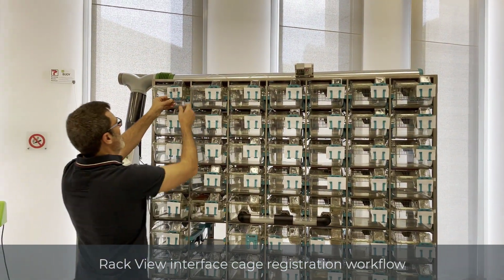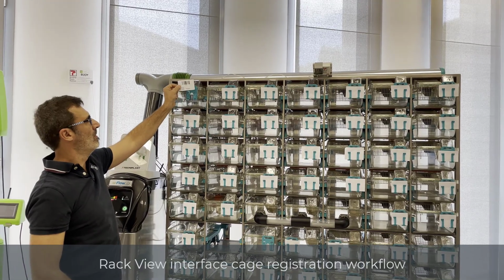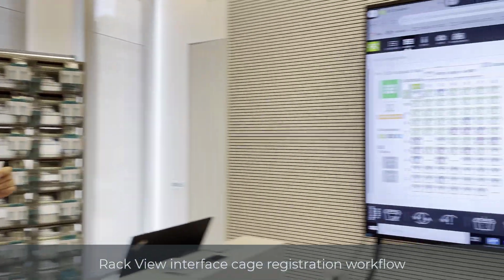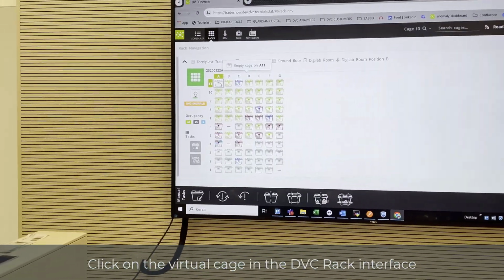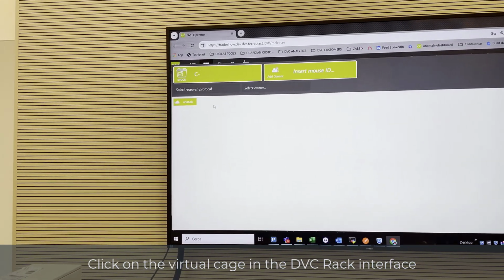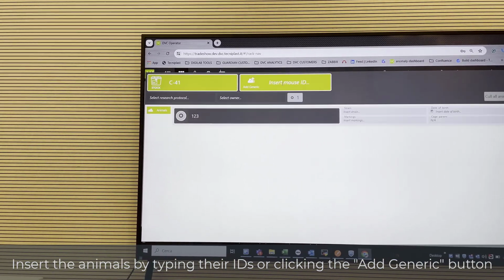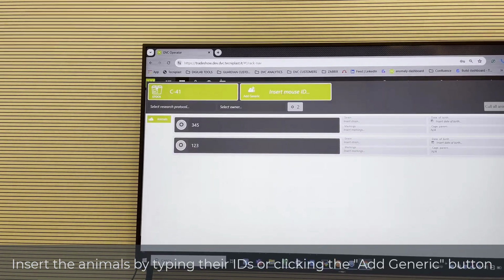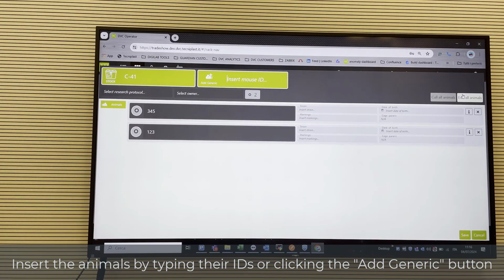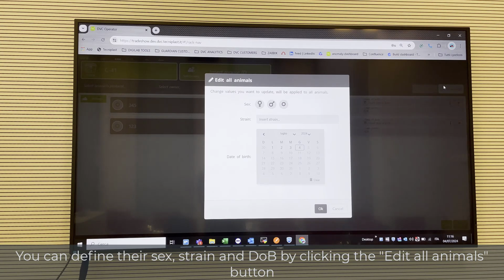It's going to register a specific cage already placed in the rack with animals. The cage name is C41, and basically through the DVC operator interface it's possible to click on the cage, type the name of the cage ID, and insert as many mice as needed. Here you can see that simply by inserting the number of mice, in this case with a specific ID, or could be also generic mice, they will immediately appear.